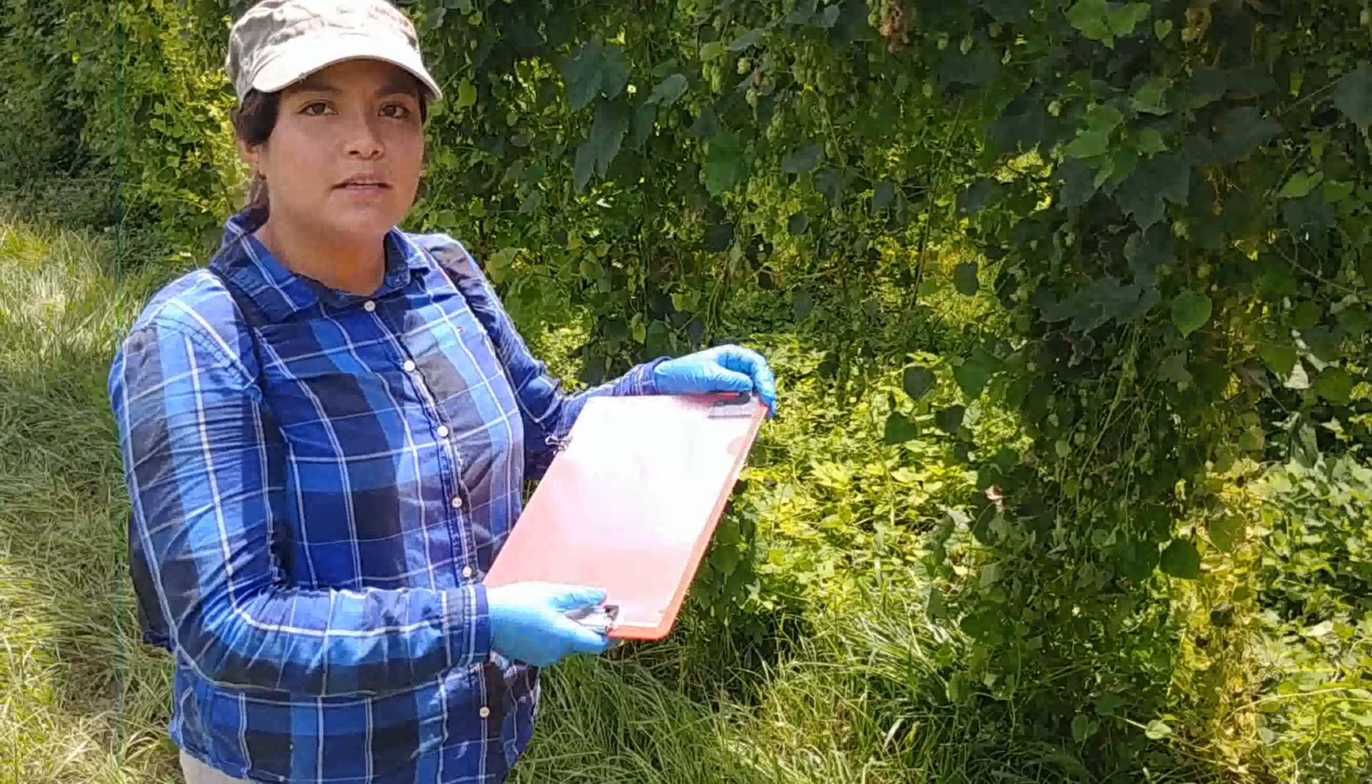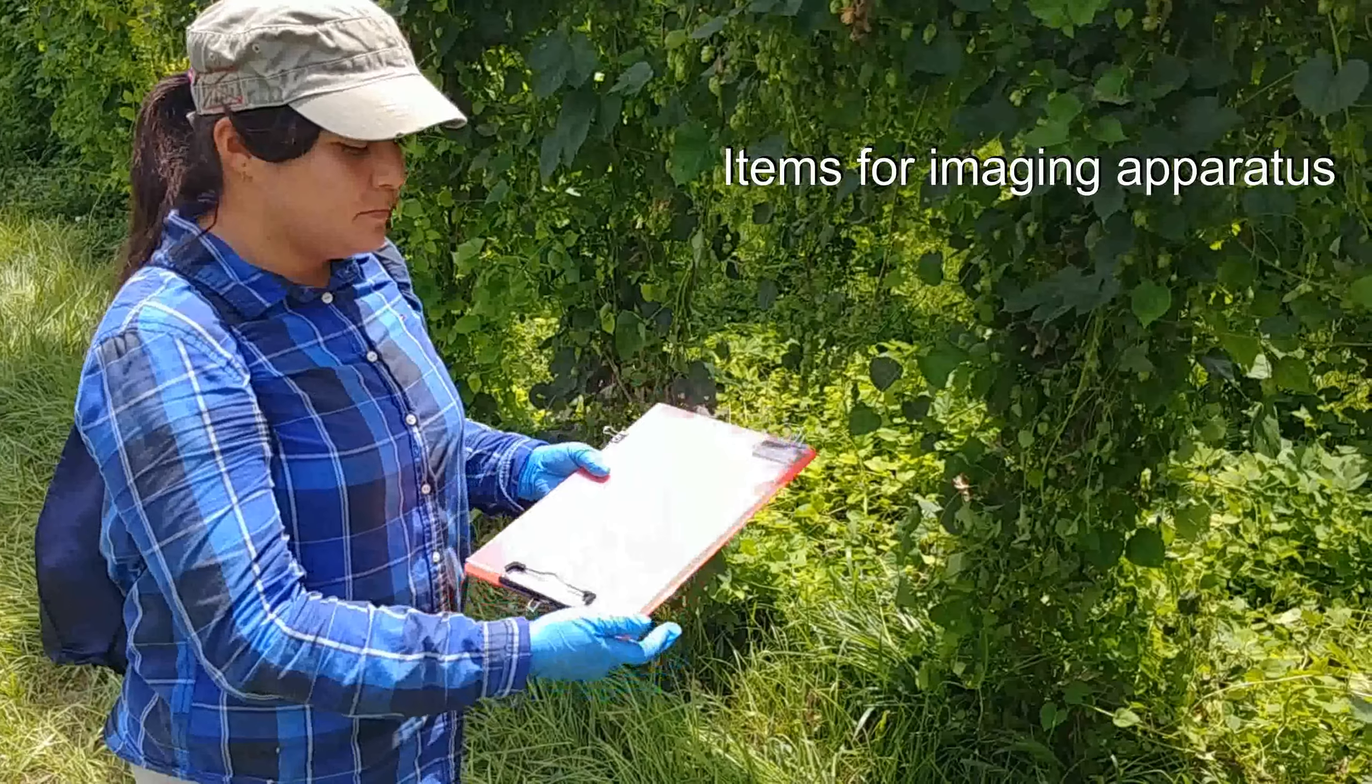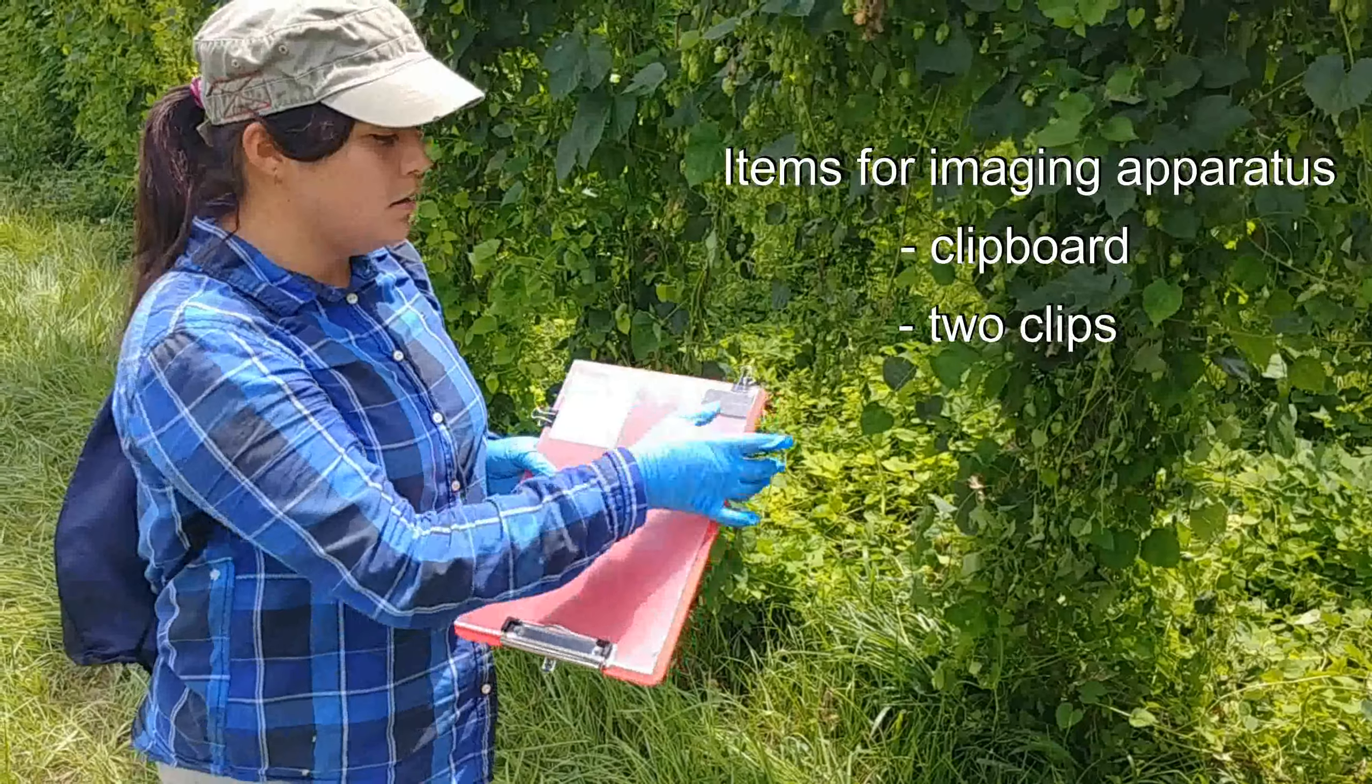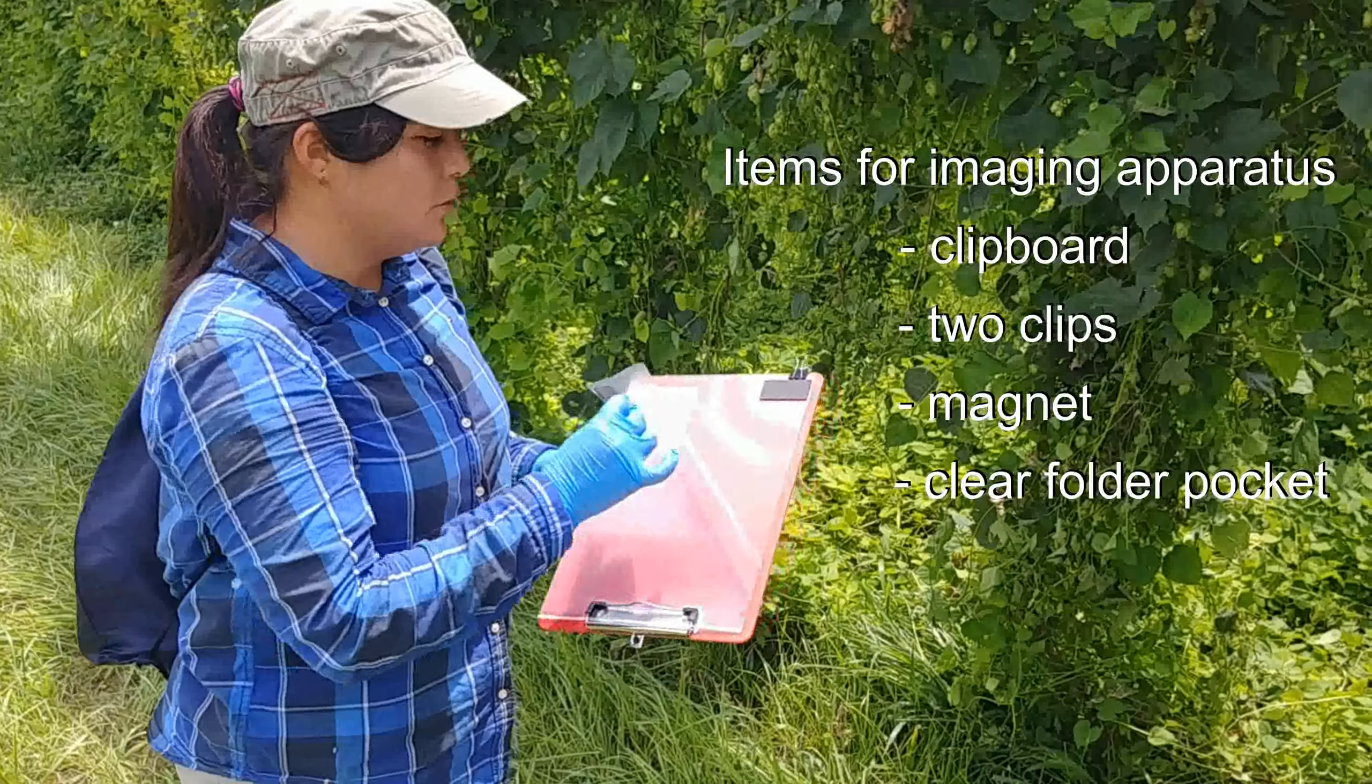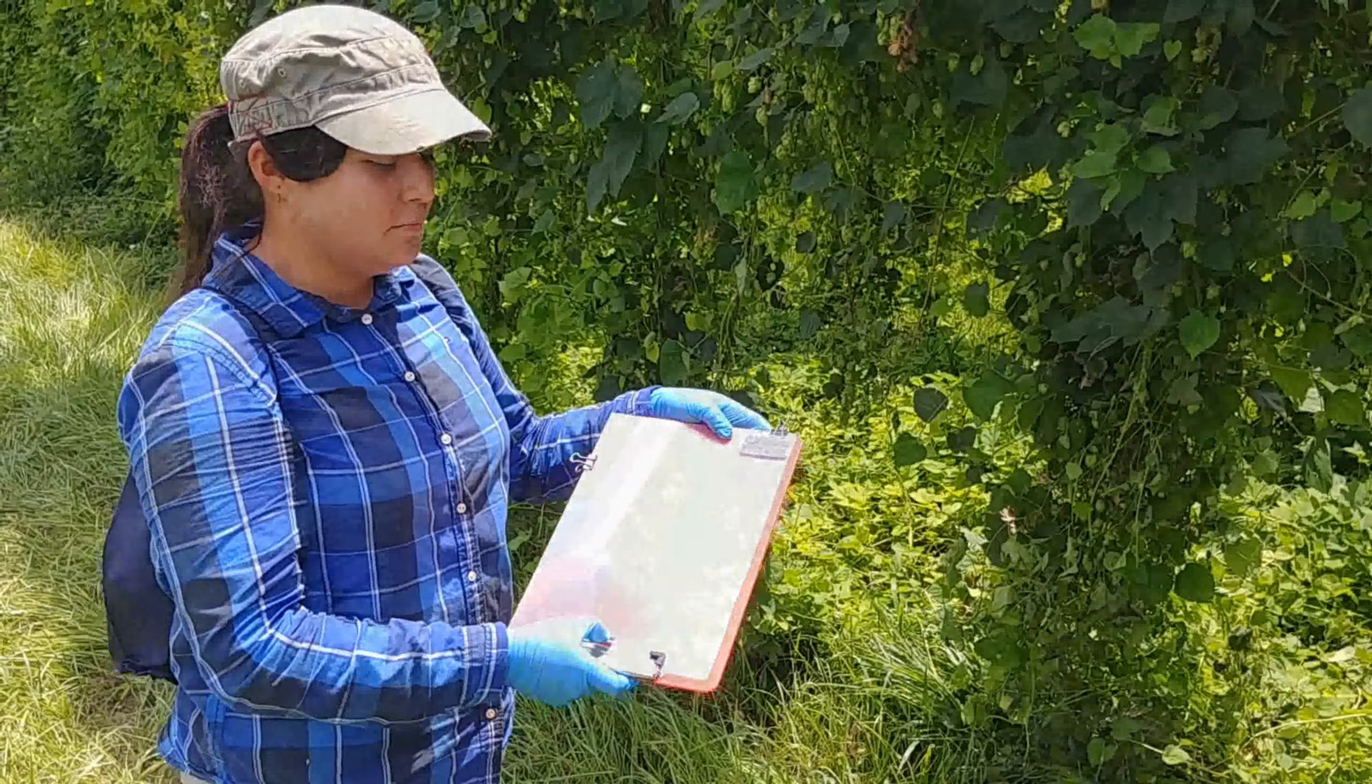In the picture for leaf area measurements, you'll need the clipboard, two clips, a magnet, a clear folder pocket, and a post-it. That's all.